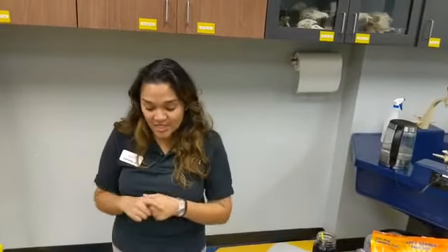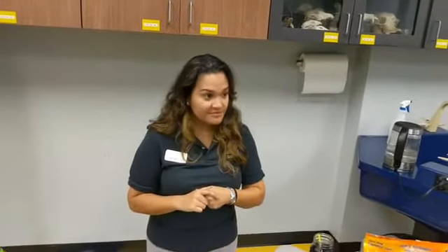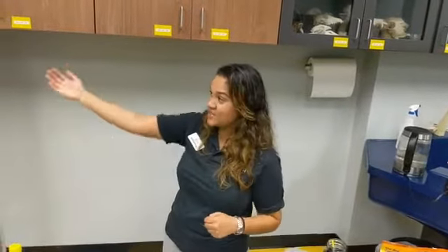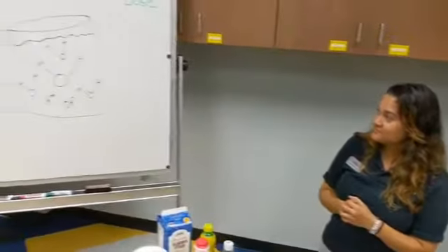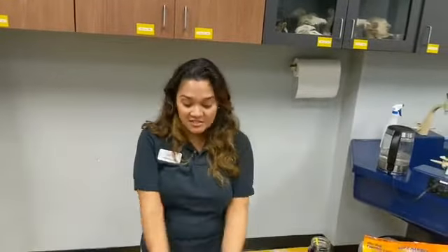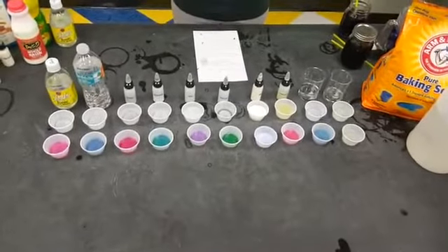So while Mr. Jose is working on our meter, we can go ahead and look at some things over here. Actually, no, let's not do that. We'll wait until we have our meter ready. But what I do want to tell you is these different liquids I've tried before in a few different areas. In school, at science museums, at home, I've had some experience with these.